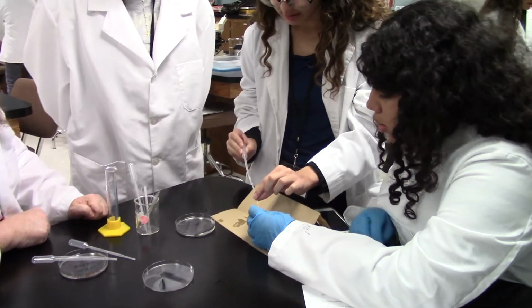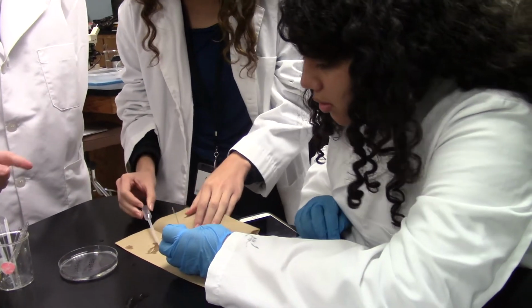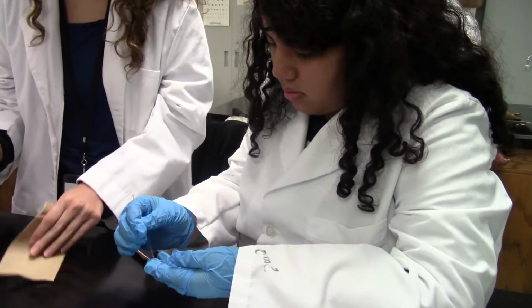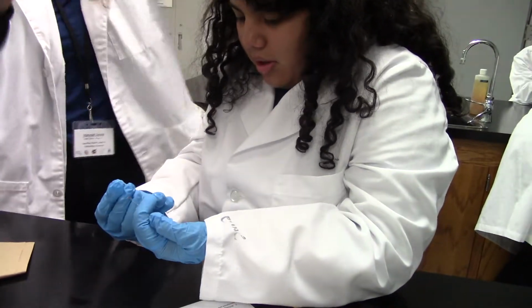So again, the tube. And hold the end when he goes in. Oh, he likes to stay at the top. You know how you did it before. Get him kind of knocked down a little bit. Use a paper towel. It's going to get sugary and sticky. Oh, yeah, there you go.